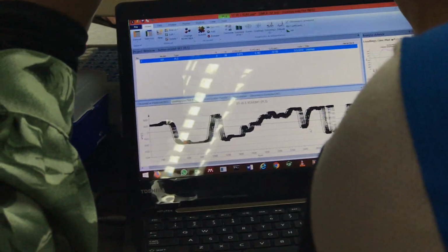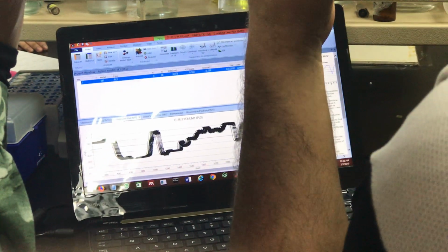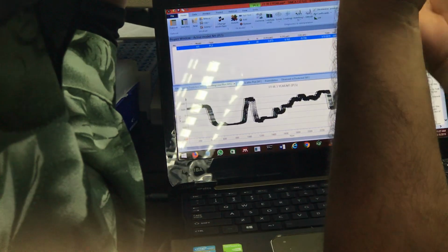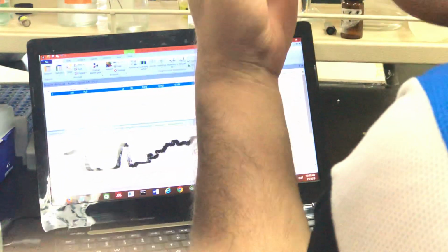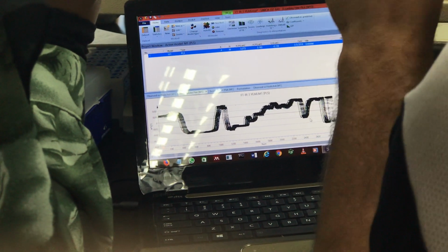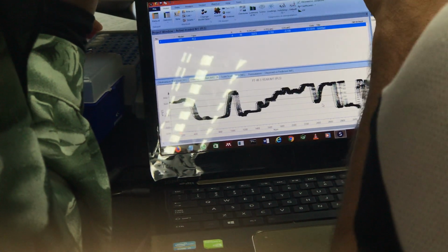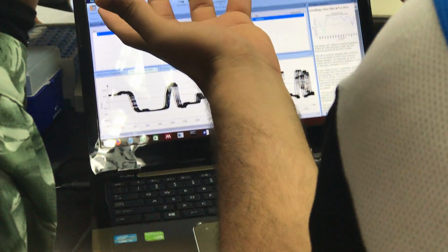When one component, meaning the first component, we have how much difference is detected, how much percentage of the difference? If we have 4 components, that means as many components there are, the stronger the data. If we have only one component, that means one component identifies all the difference. The difference means between the spectra, among the spectra, or among the data.